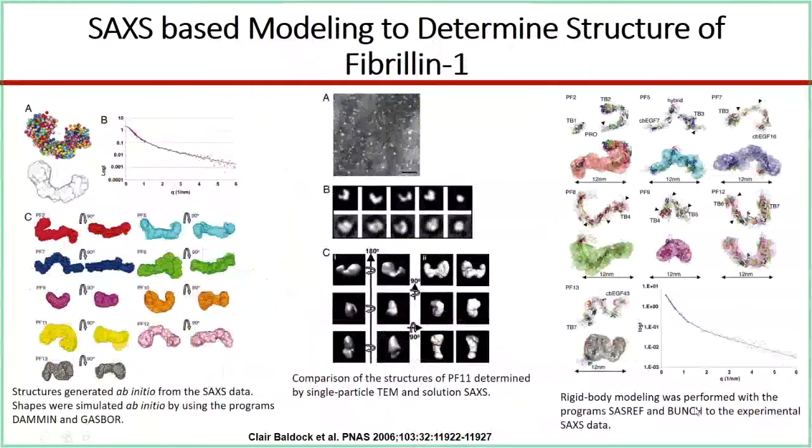So there is this other example of a protein called fibrillin. Again, this is a 330 kilodalton protein. It's a multi-domain extracellular matrix protein that polymerizes to form like 57 nanometer periodic microfibrils, and it's basically essential for tissue elasticity. Widely distributed in blood vessels, lung, and skin, it acts as a lattice for elastin, I'm sure a protein that you've heard of, deposition during elastic fiber formation.